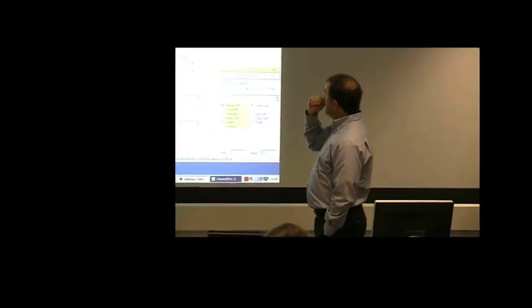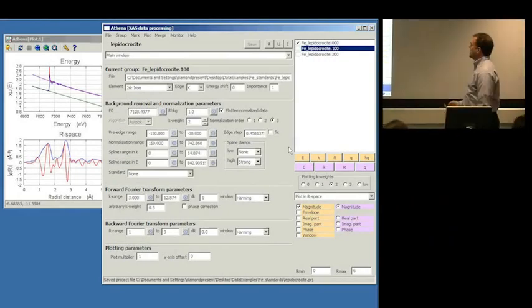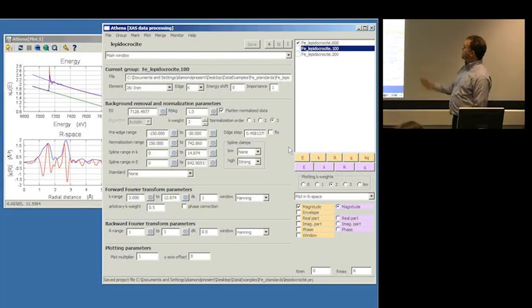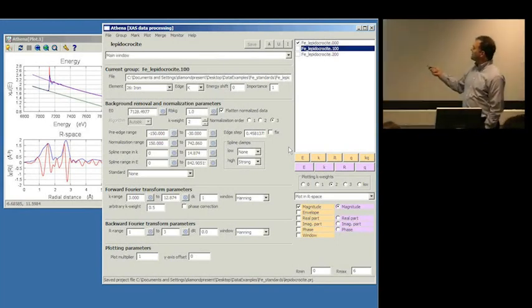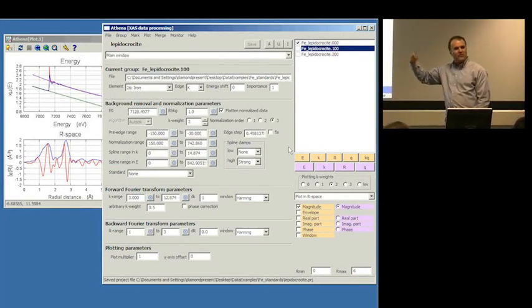Okay, now I've saved, and the program is less stressed, so now the save button is not only not red, it's actually turned off. But as soon as we start doing things, the stress counter will start counting up again, and it'll start turning red again.